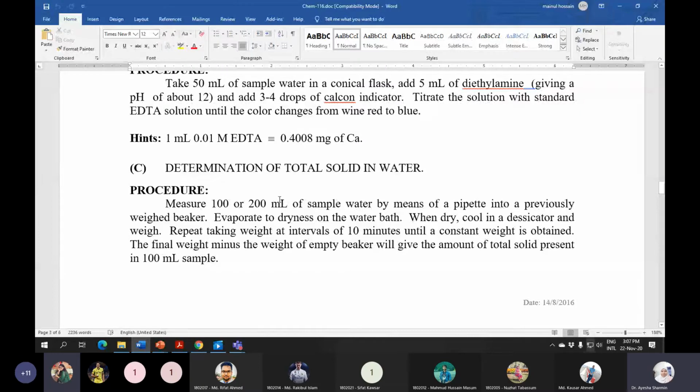1000 kilogram per meter cube, ma'am. Okay, or you can say 1 gram per cc or cubic centimeter, right? Because we are using milliliters, 1 cubic centimeter is 1 milliliter. So theoretically, the weight of the water will be 100 gram. Because you are taking 100 ml, that should be close to 100 gram, if the temperature and pressure are 25 degrees and 1 atmospheric pressure.